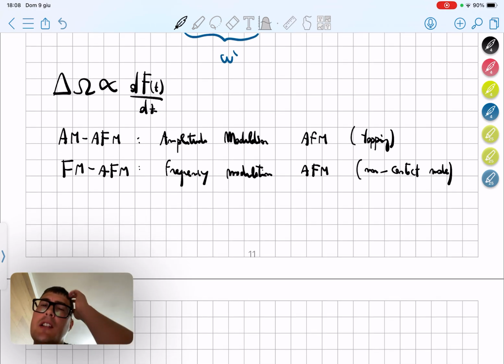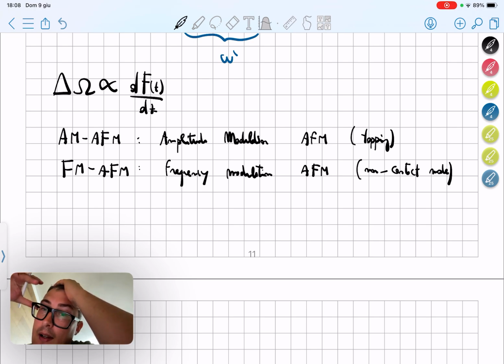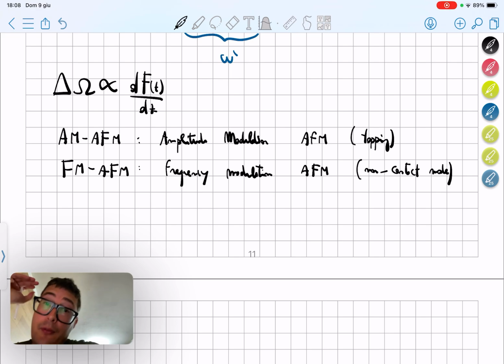we start far away from the sample, in the sense that there is no interaction in the place where we start to make our experiment. We deliberately bring the cantilever closer to the resonant frequency, not exactly to the resonant frequency, but closer. Because it's closer, there is this gradient effect that we have just shown that modifies the dynamic response. So the gradient is somehow important.